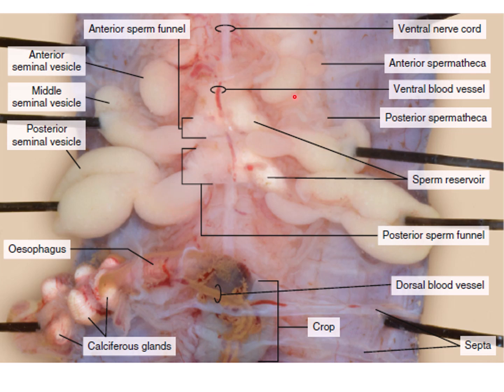The female organs are smaller than the male organs. There are two pairs of round, glistening white seminal receptacles or spermatheca. So these spermatheca, here we can see an anterior spermatheca, and then the pair of posterior spermatheca. They are easily visible in segment number 9 and 10. They store spermatozoa of another individual after copulation.